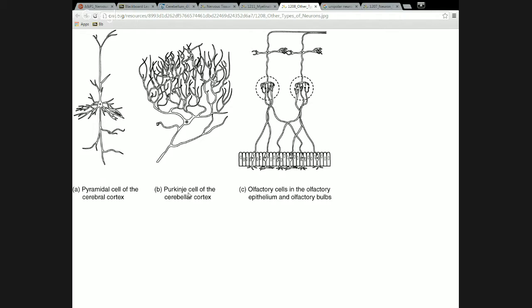There are actually a number of things in anatomy that are named after him because he discovered them, and this being one of them. Now, what we're going to see under the microscope is only the cell body, but understand that coming off the cell body, there are a bunch of dendrites and a pretty significant axon coming off of it down here.